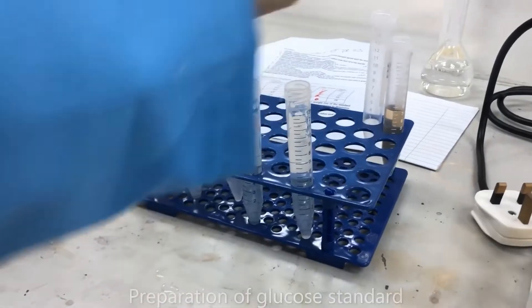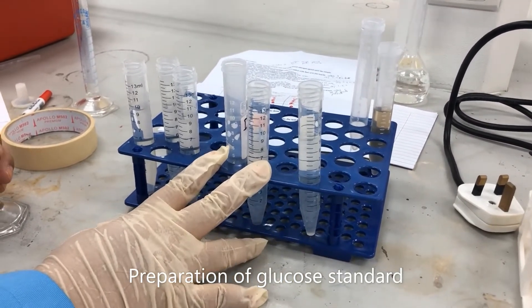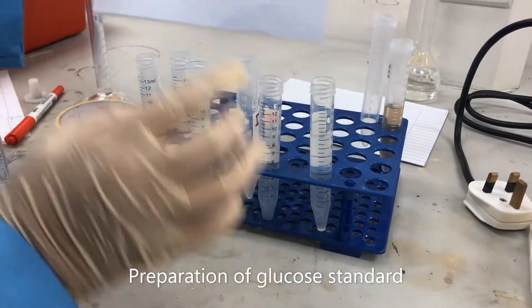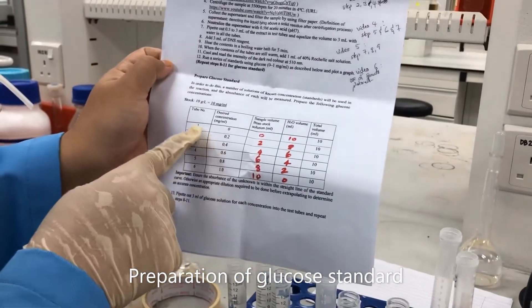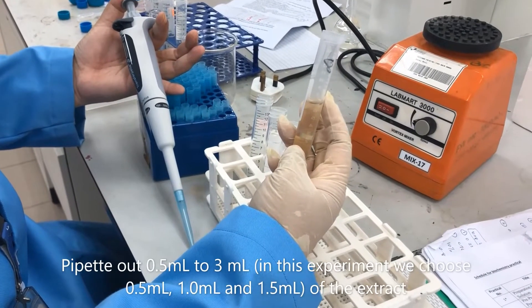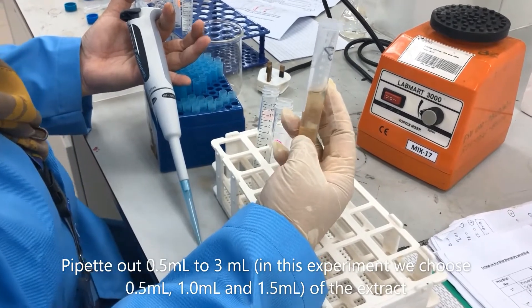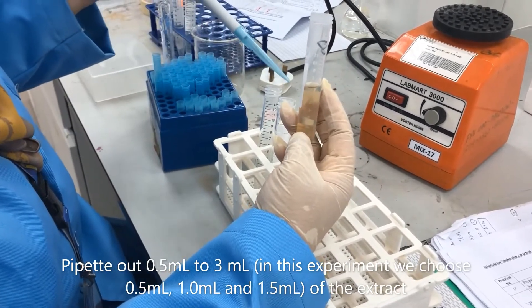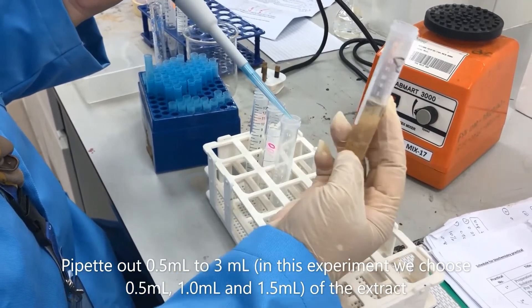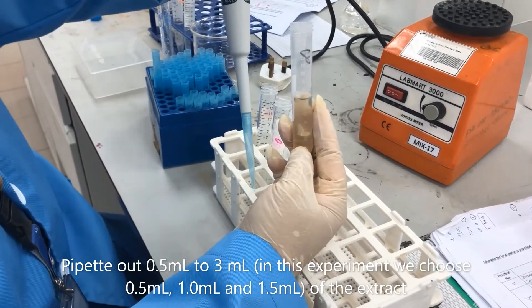This is the glucose standard — we have mixed distilled water and stock solution accordingly. Refer to the table, refer to step 7. We pipe out 0.5 to 3ml of the extract. We have selected to do 0.5, 1, and also 1.5ml volume of the extract. Here we pipe out 1ml.